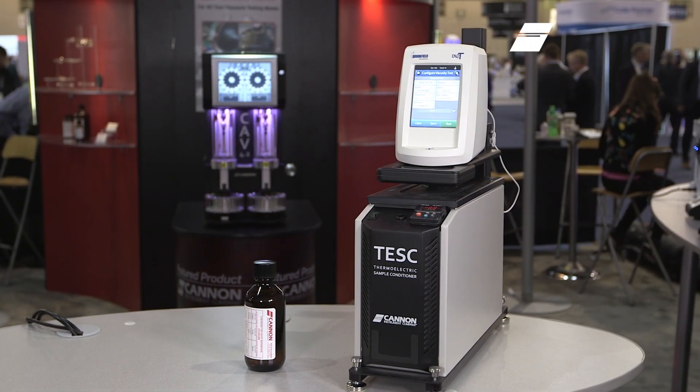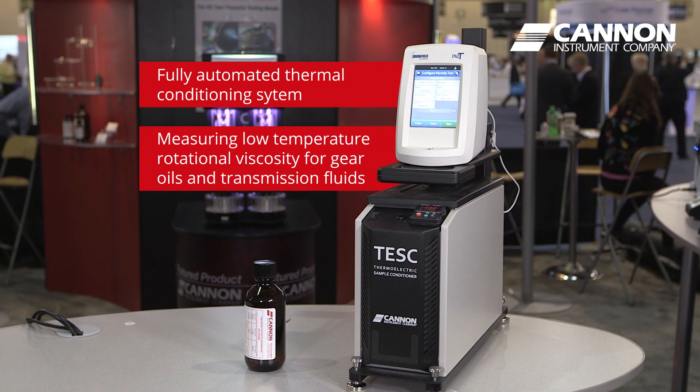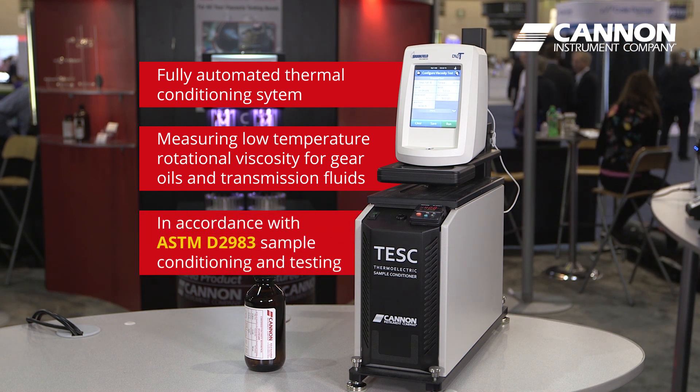Hi, my name is Pat Magai from Cannon Instrument Company and today I'd like to introduce you to our TESC low temperature rotational viscometer system. The TESC is a new fully automated apparatus for measuring low temperature rotational viscosity for gear oils and automatic transmission fluids in accord with ASTM D2983.